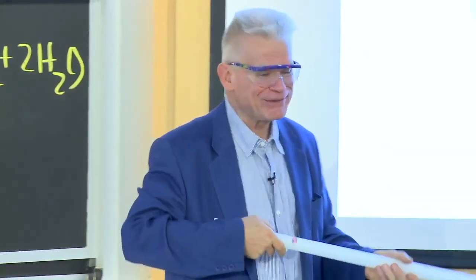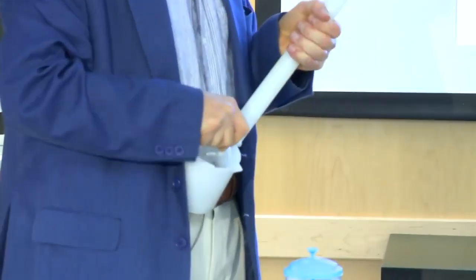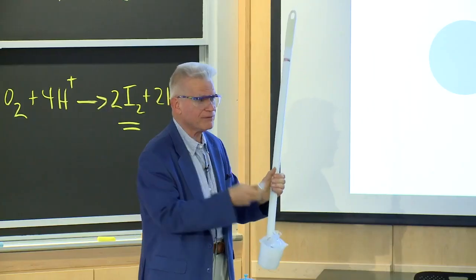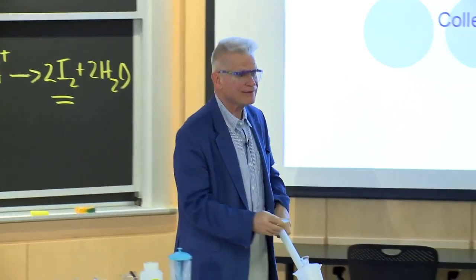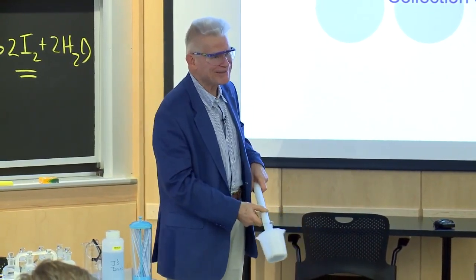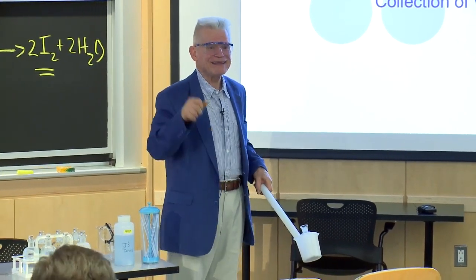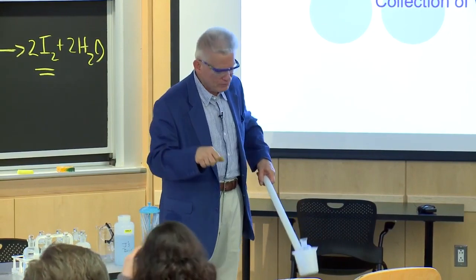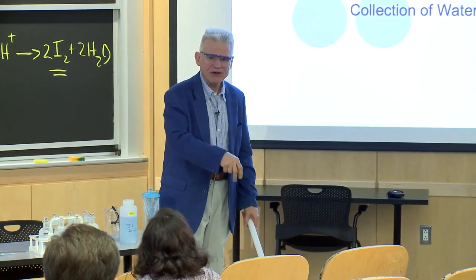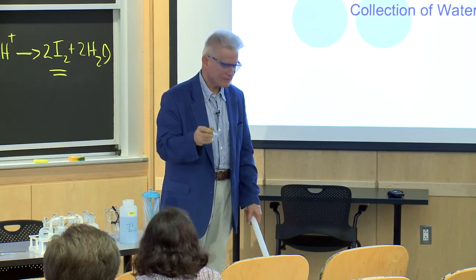So you get your stick, and what you do is you insert your BOD bottle, snaps into the clip that I've got inside. You take the stopper out, and then you go to the edge of the dock. Don't fall in, and don't push anybody, okay? Remember the cyanobacteria and all that out there. And take gloves with you, because when you put this underwater, it's got to be completely submerged. You have to reach over the dock. You've got to stopper it underwater. So you've got to have gloves with you, all right?